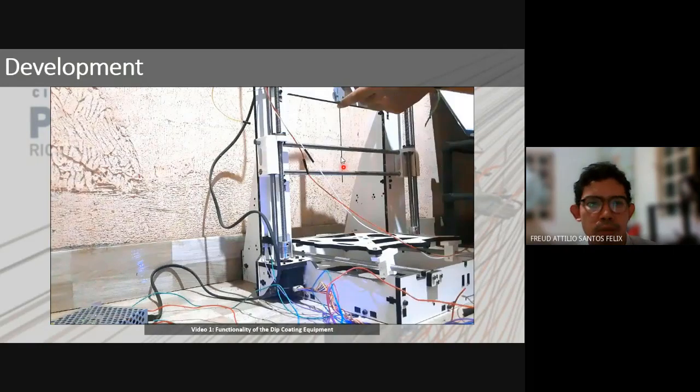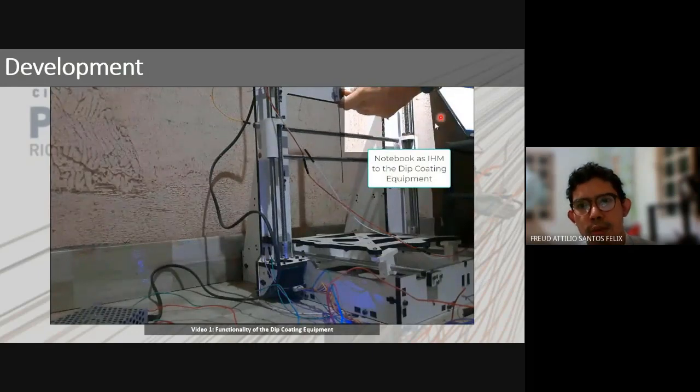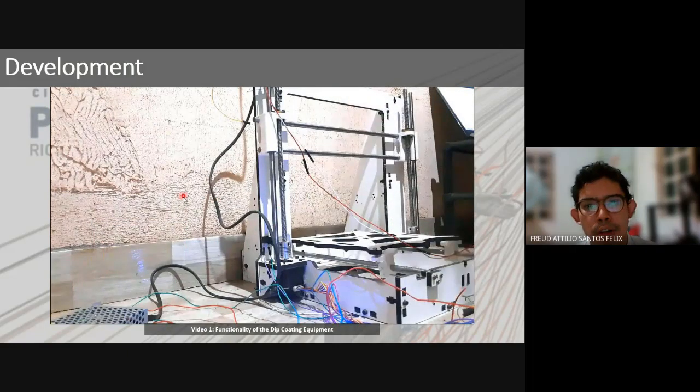upward movements. We have here the power supply, the notebook as the human interface machine to the equipment. And next, we will have the end of all the functionality of this equipment.